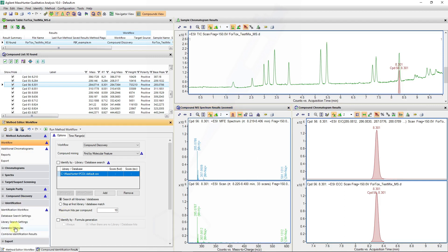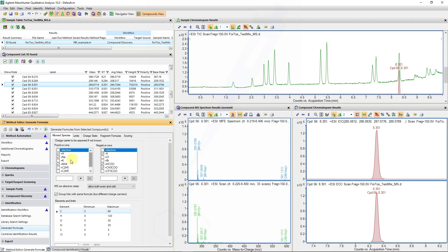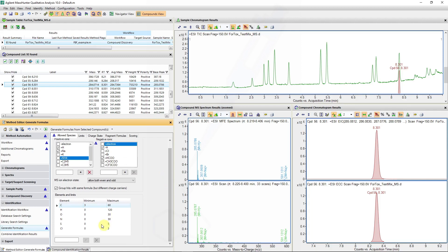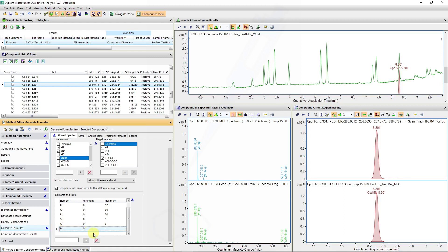Under the identification tab, under generate formulas, I can make sure that I have different charge states and charge carriers selected, as well as include any elements that I need to. If this is a sample from a system that contains bromine, I would add bromine in this list as an additional element. In this case, this was just a standard and we will keep the default settings.